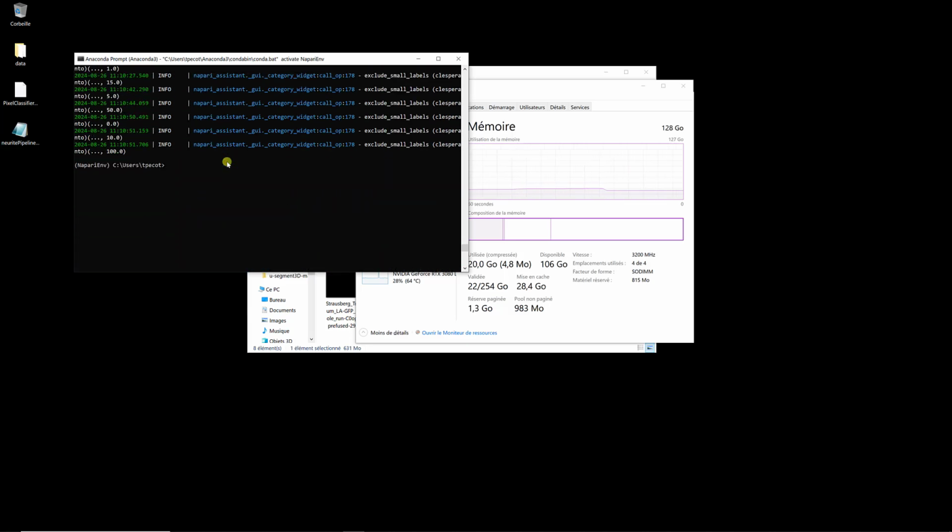But it's possible when you work on the pipeline, maybe at one point it's just gonna shut down and it's fine. Again, it's not the most stable plugin, but as you can see, you can still do very interesting things.